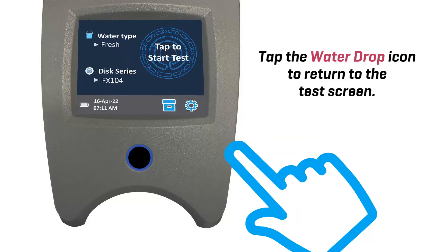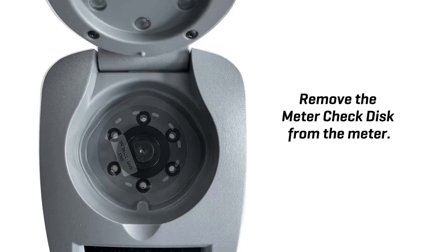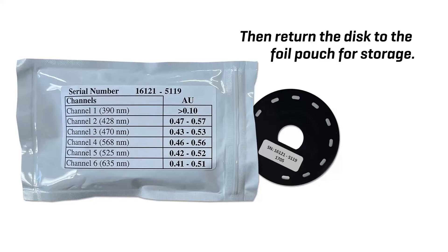Tap the water drop icon to return to the test screen. Remove the meter check disk from the meter. Then return the disk to the foil pouch for storage.